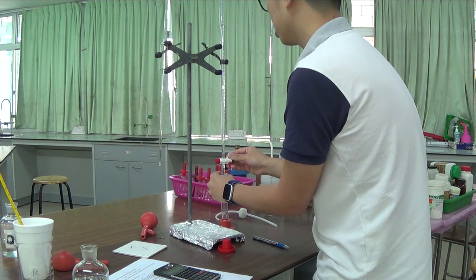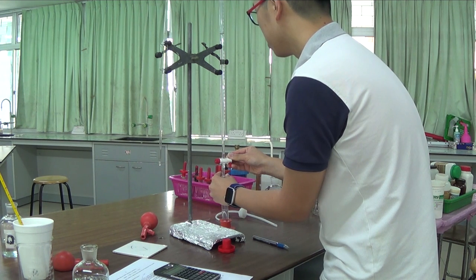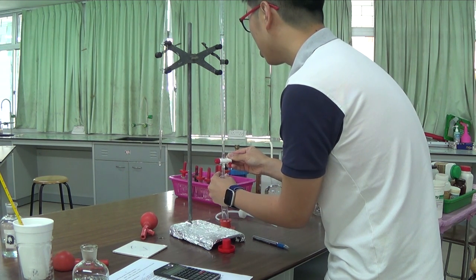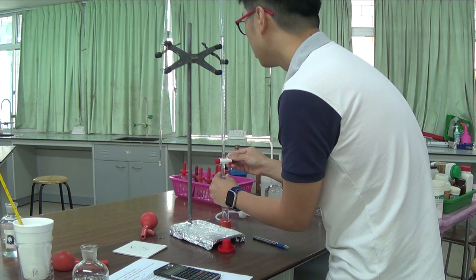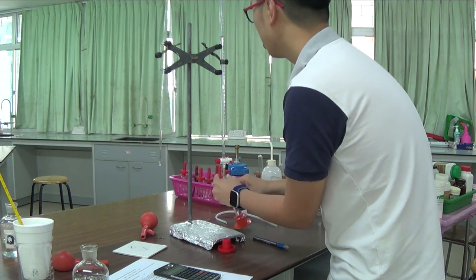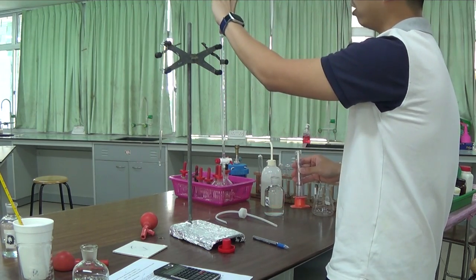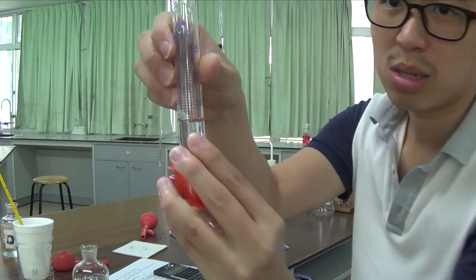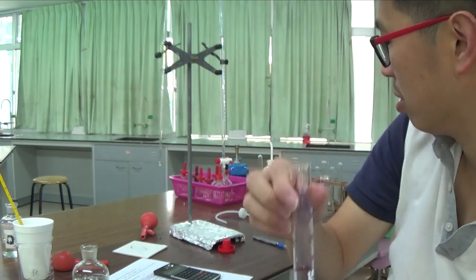So once it reaches 26, I must slow down and do it drop by drop. So now I'm doing drop by drop. I don't want to overshoot it. So that is now 27.00 on my burette. I started out from 15.00. So that is 12 mL. So this is 10, this is 15. So that is 12.0 cm³.